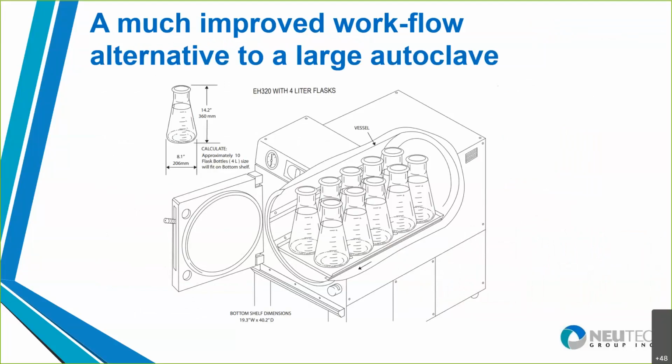So, of course, the advantage of having one of these media preparator systems over the traditional way of filling media in flasks and then putting them inside an autoclave is, the biggest advantage, that you're not dealing with all of these individual flasks or bottles, any of which have the potential to be dropped and broken. They're hot.